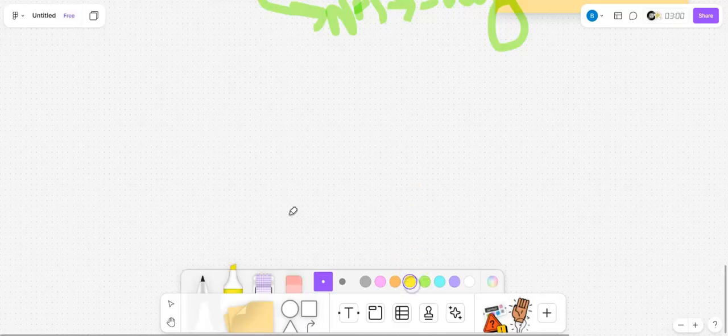Let's see. Here, మనం ఒక tube తీసుకుంటాం. We'll add DNA here. So, I'm adding DNA. Phenol chloroform method కాబట్టి, phenol as being non-polar, I'm using different colors to differentiate it. So phenol, as it is non-polar, does not dissolve in water. అది దానికి ఒక separate layer form చేసుకుంటుంది.